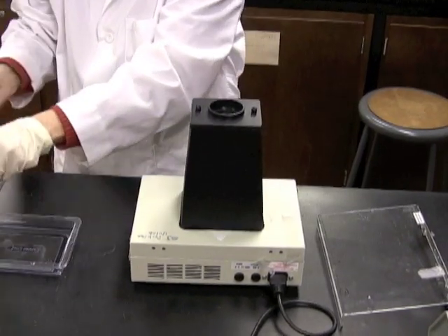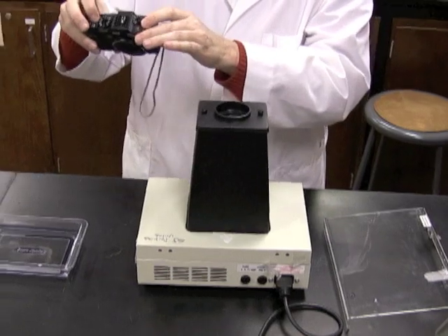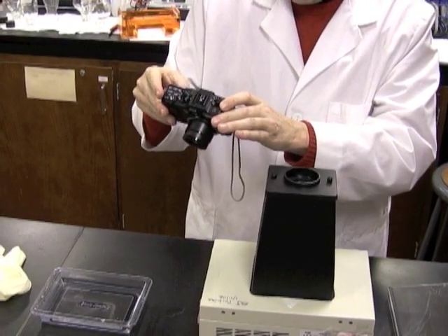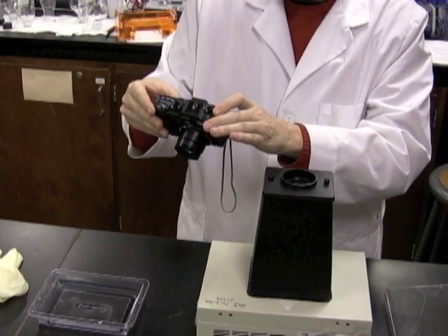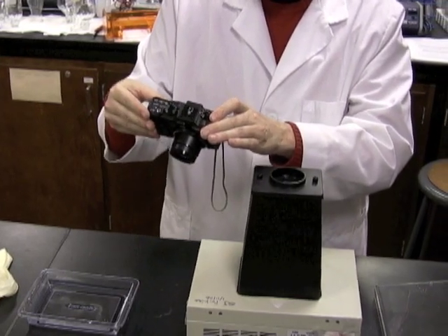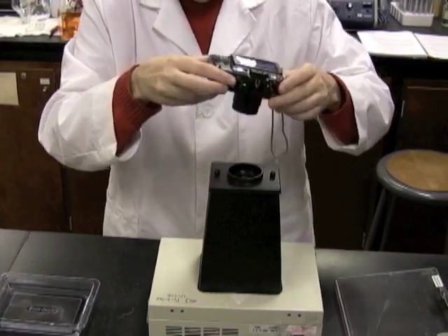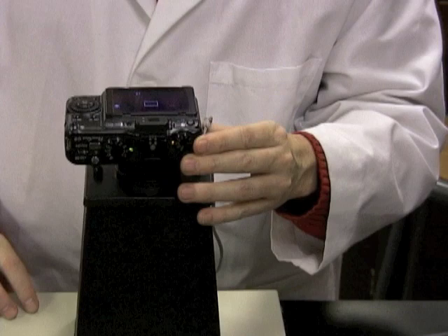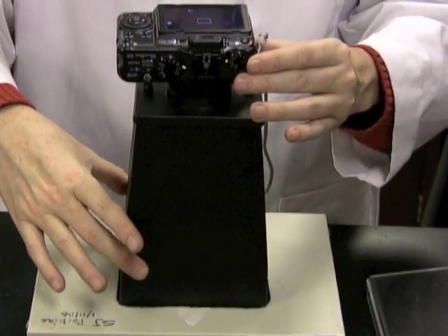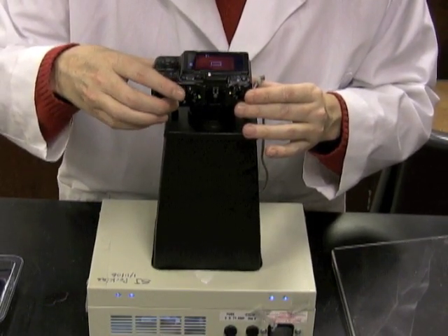And once you've done that, get your digital camera and turn off the flash for your digital camera. And also set up the camera so that you're using macro photography. Okay, once you've done that, you're ready to take the picture. So, take the camera and place it over the opening in the hood. And then you can take the picture. Okay, once you take the picture, it looks something like this.